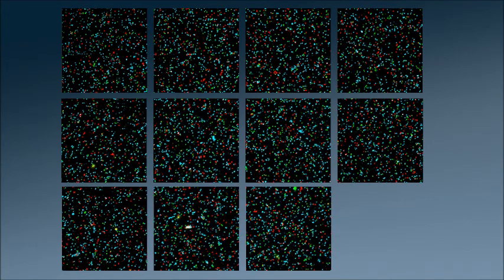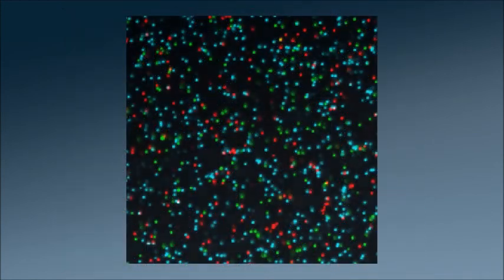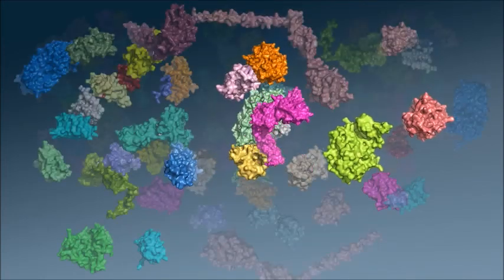The fluorescent sequencing signals are recorded by scanning the entire flow cell. Here's an example of 3 sequencing cycles. Our current flow cell setting will allow us to analyze more than tens of millions of single or colocalized polonies in each experiment. So what are the advantages of our method?